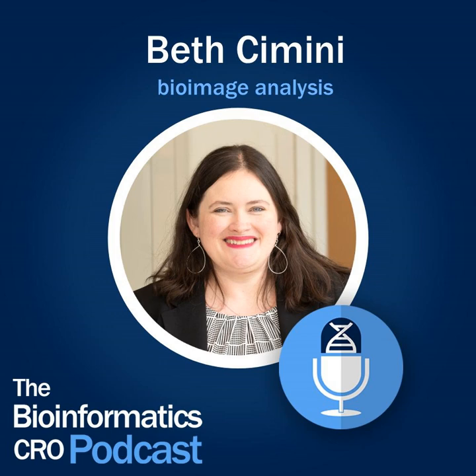It should be that one thing feeds into the next, and that your image analysis and your data analysis helps you design the next best experiment. And when you do your pilots, you analyze them all the way through to make sure that you can actually detect the statistical measurement you want to make. Otherwise, you don't know if you can actually detect the thing you care about or not. Teams like mine have office hours. A lot of places, your friendly imaging core will have a friendly local image analyst. If not, GloBIAS, the Global BioImage Analysts' Society, has a database of people who have agreed to be contacted on their website, so you can reach out and find a bioimage analyst near you who works on things that you work on.